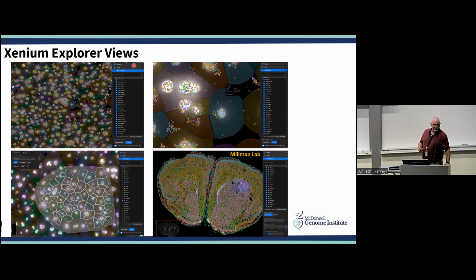The bottom left corner is the same, just zoomed in, and I just lassoed an area, and you can't see it here, but darn, that is delayed. There are gene numbers. You can output the transcripts to make t-SNE plots, to all sorts of nice, quick, easy little tools. This is just a zoomed in view here.